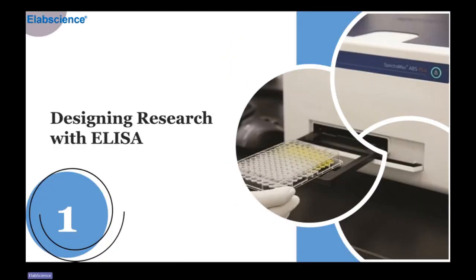So in this first section, we are going to explore how to turn the scientific question into a well-structured ELISA experiment. You will learn key principles of planning the studies that are reliable, reproducible, and ready for publication.